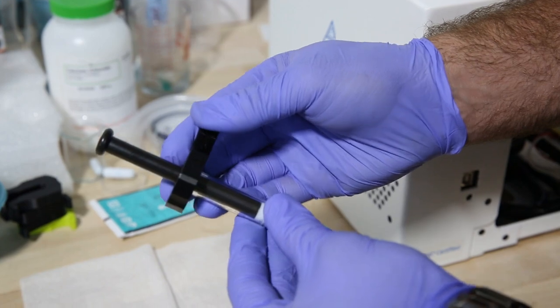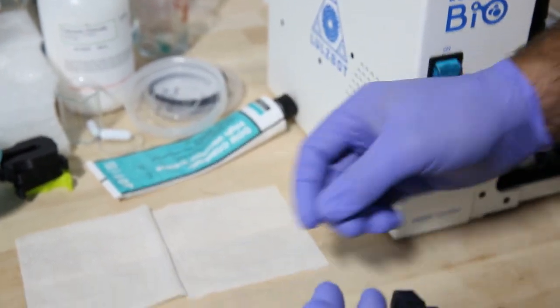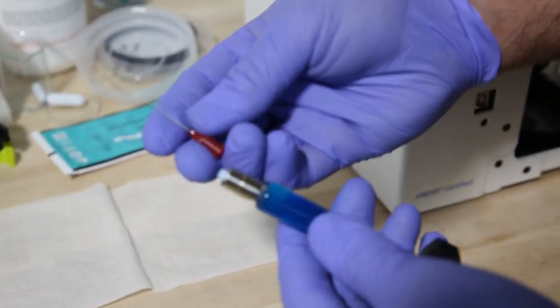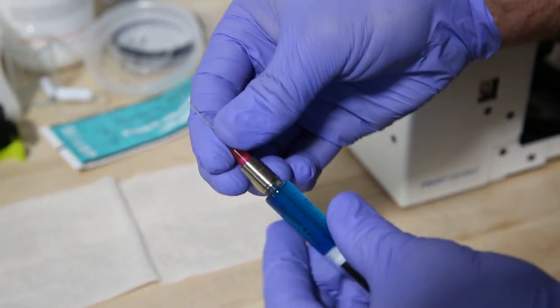So now this is ready to be loaded on the machine. We just need to add a dispensing needle. So this is the luer lock. You just tighten it into place.